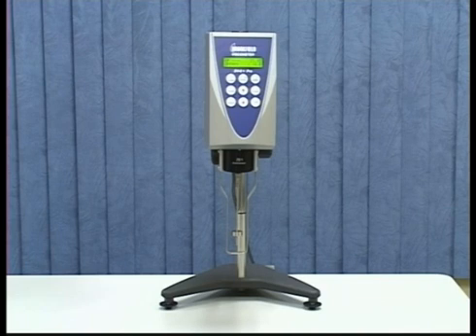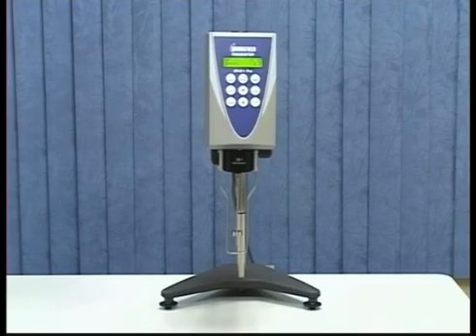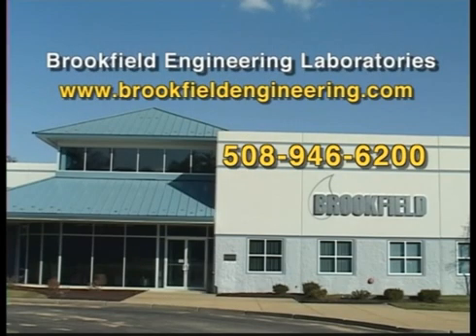Remember the important aspects of performing a calibration check: temperature, actual fluid value, torque ranges, and full-scale range. If you find the instrument is not within tolerance after performing a calibration check, repeat the calibration test to ensure everything was done correctly. If your instrument is still not within tolerance, contact Brookfield Engineering or an authorized dealer.